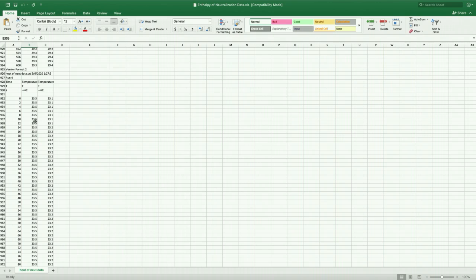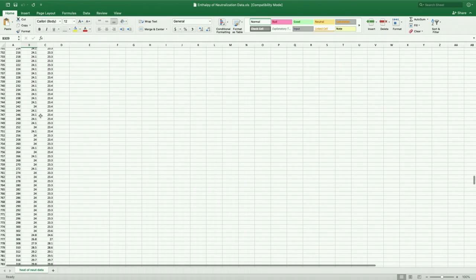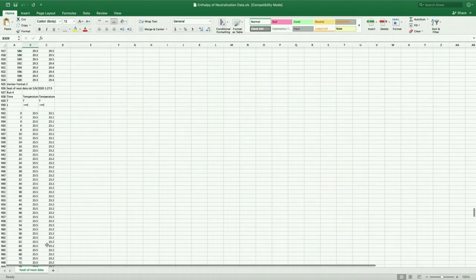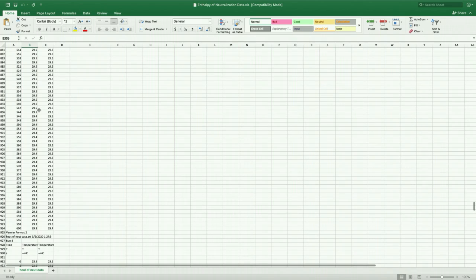Now, for the acid-base reactions, and really for both in general, remember what you're looking for. For the acid-base reactions, we had very similar temperatures starting off, and then eventually we get down to around 300 and we see these temperatures start spiking. So we're interested in what's the highest temperature things actually get to. Oops, I kind of backed out there. So you're going to scan through. It looks like these temperatures are about the same for a while.